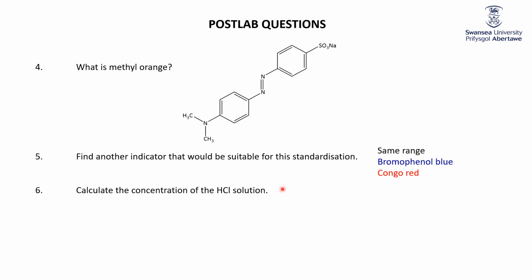And finally, what was the concentration of the HCl solution? Well, we used the average value that we just determined, 0.0868 moles per cubic decimeter.